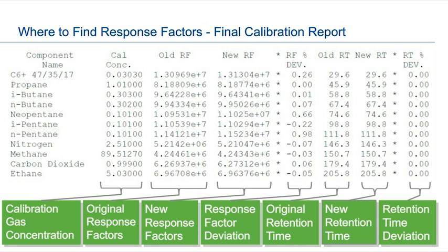The next column is the calibration concentration column. That is absolutely critical. If you think of it, that actually goes into the calculation of the response factor. This is the concentration of the component as found in the calibration gas. So that's what we just talked about previously. These are what comes off the certificate of analysis label that's attached to your calibration cylinder. And again, you can validate them against the component data table.